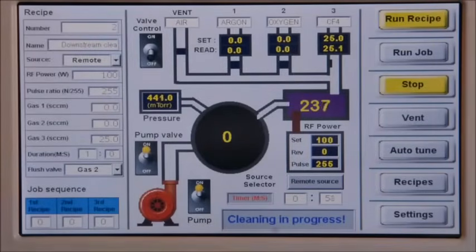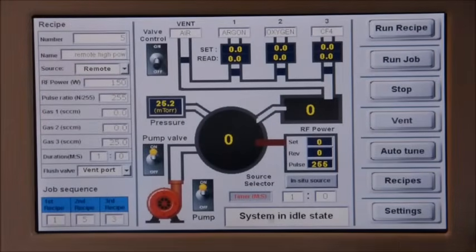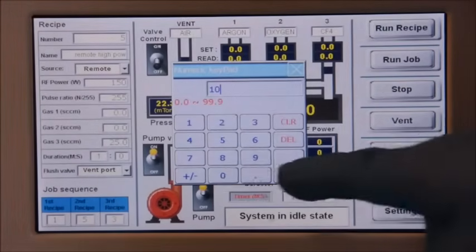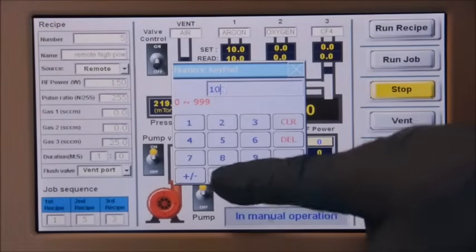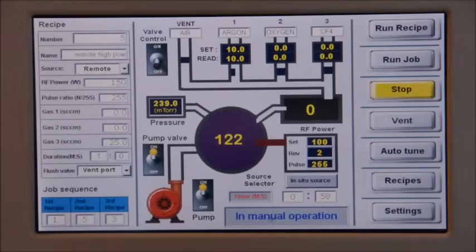The number in the middle of the remote plasma source indicates the strength of the plasma. Tergio Plasma Cleaner can also be operated in manual mode. Typing a number in the flow rate panel will start gas flow immediately. The user can also set the power and duty ratio of the RF power supply, and plasma will then ignite.